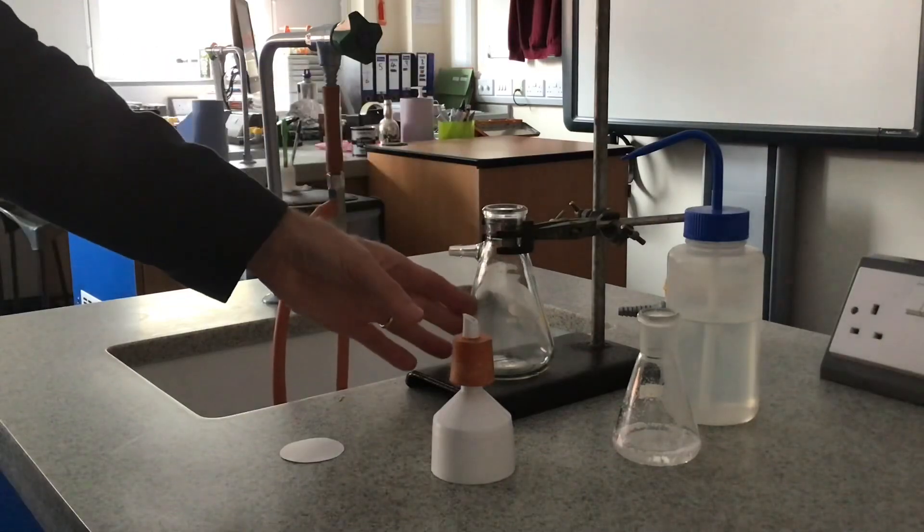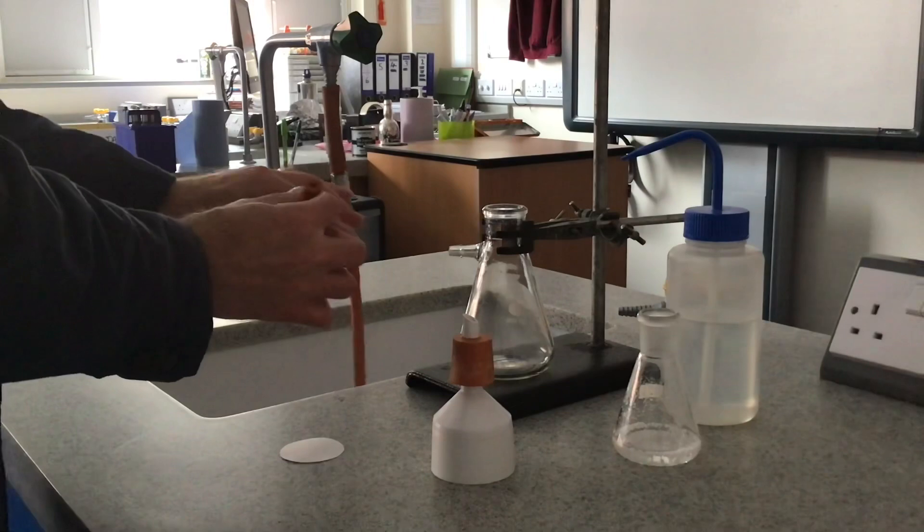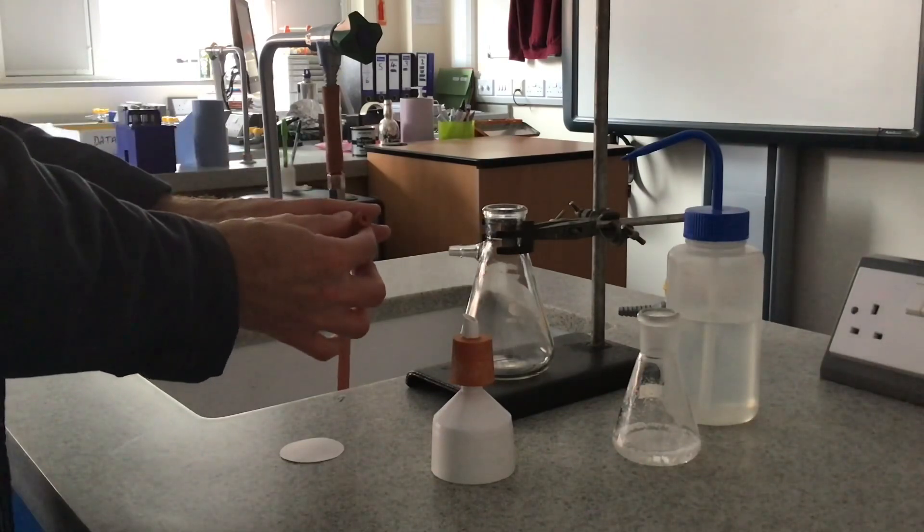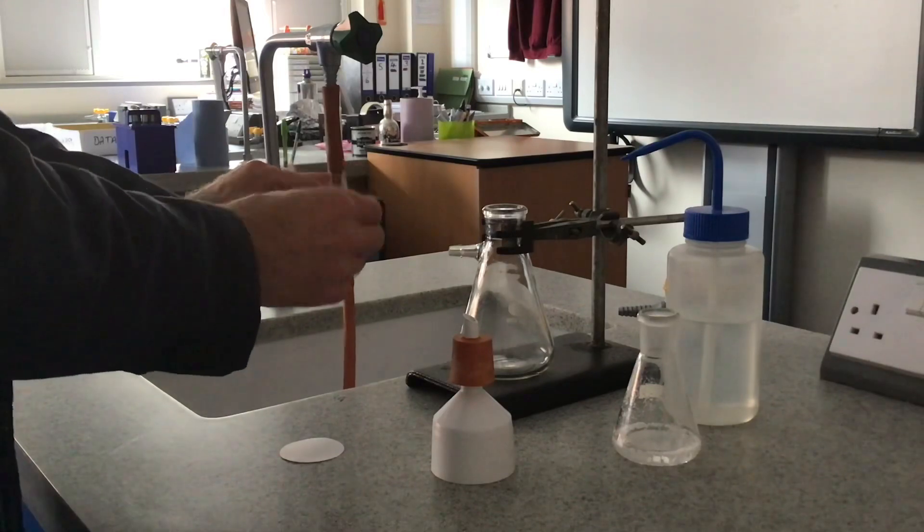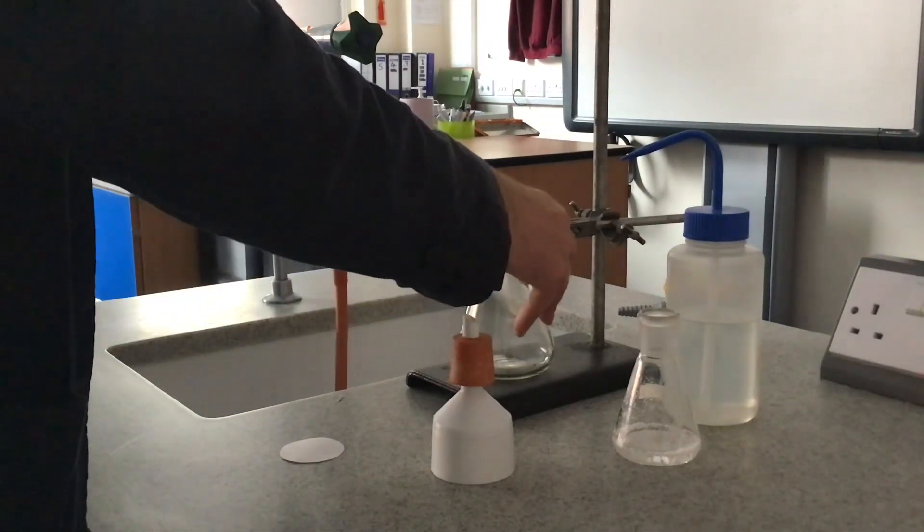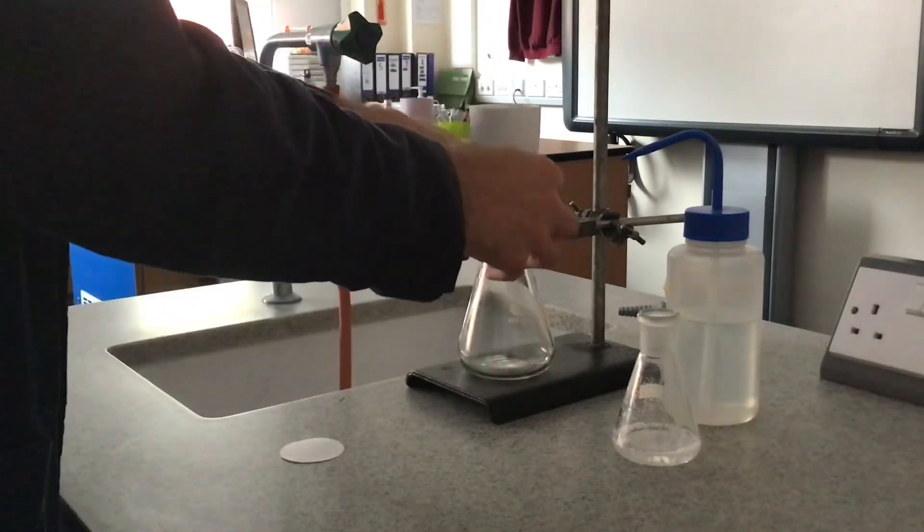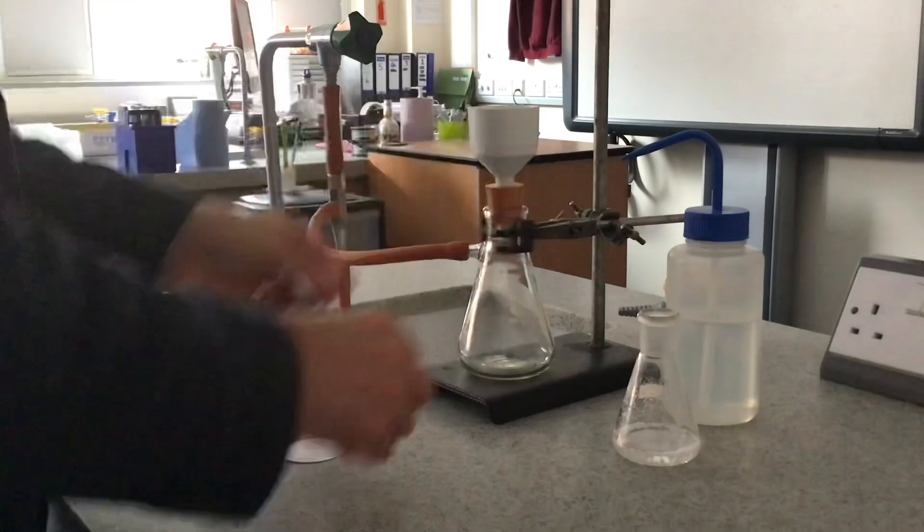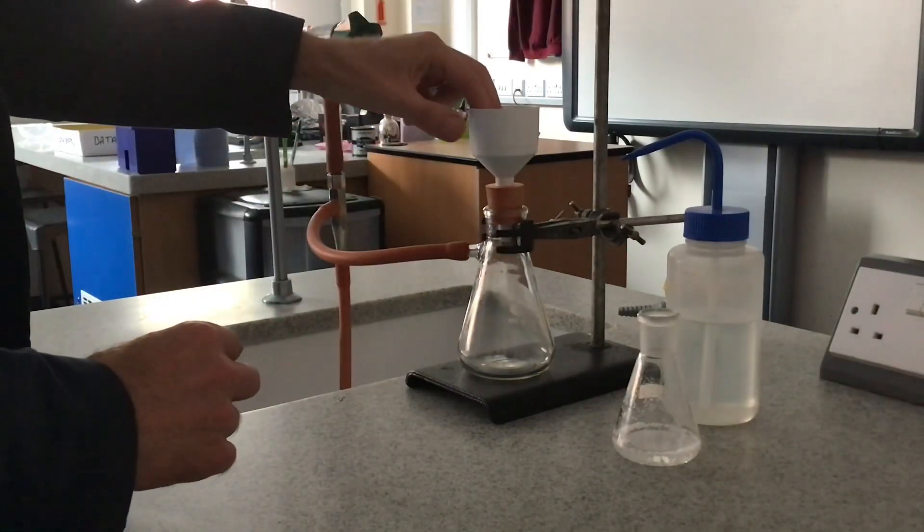I've clamped up the Buchner flask, so the first thing I'm going to do is connect this pressure tubing. This part of the water pump has high pressure tubing, so it's very thick rubber tubing. I'm then going to put on the Buchner funnel, make sure it's well sealed, and then put the filter paper disc in. Make sure all those holes are covered.